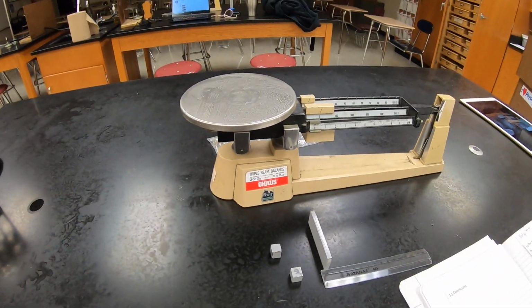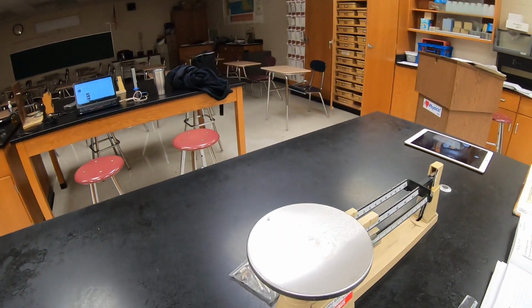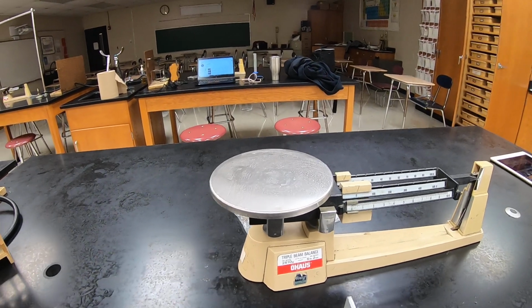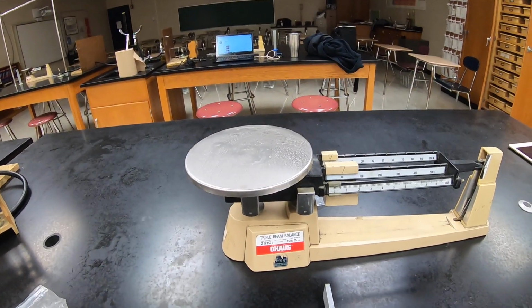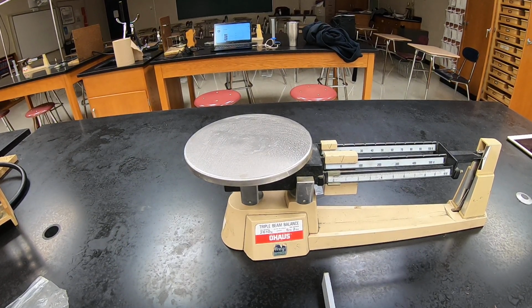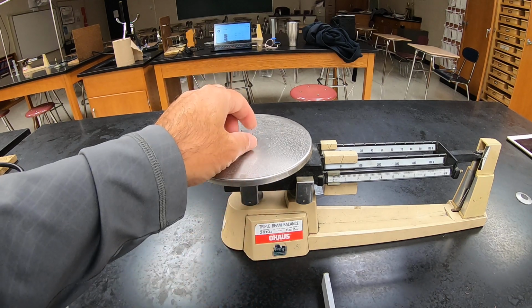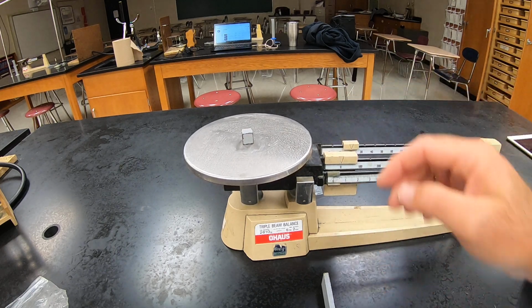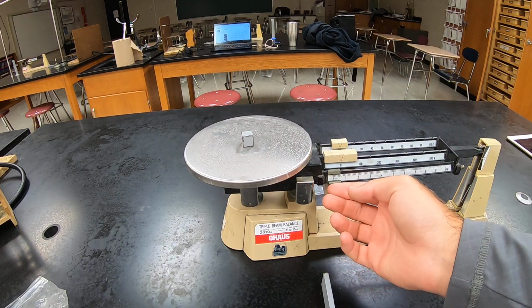Now we want to go back through and find the mass. So let's get this rock out of here. We'll just start with cube 1. We'll put it on the balance. I'm sure it's not 10, but we'll check anyways. Oh, it is 10. So it's a little bit over 10.